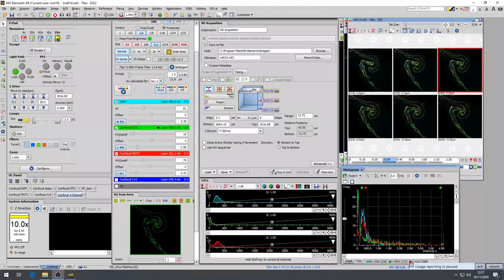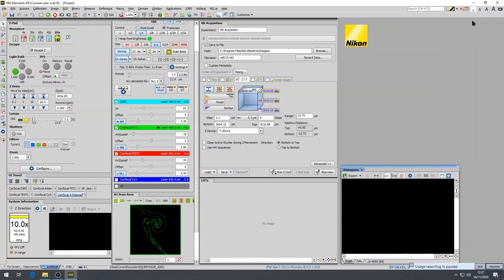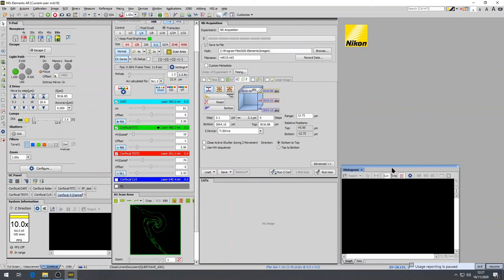Once you are happy with the images you have collected, save them as ND2 files in a folder you have created with your name on the D drive. This will not only save images but all of the imaging conditions for laser power, gain, lens, scaling within the metadata so you can reuse them when needed. You can also export images as JPEG or TIFF for presentation purposes but always save the raw images first before using any image compression.